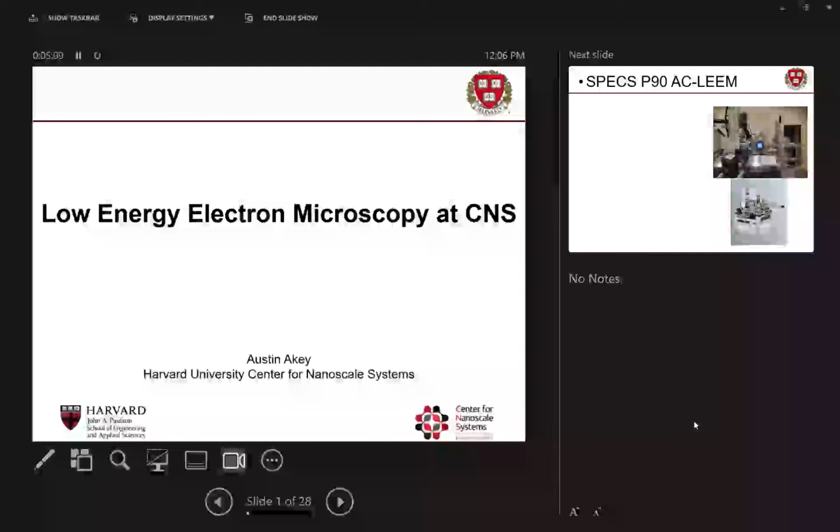All right, everybody, I have to introduce myself today. So I'm Austin Akey. I'm part of the CNS imaging team. I'm going to be giving you a talk about one of our newer tools down at CNS, which is the low energy electron microscope, which is a very unusual capability that we've got at CNS. You won't find it a lot of other places.